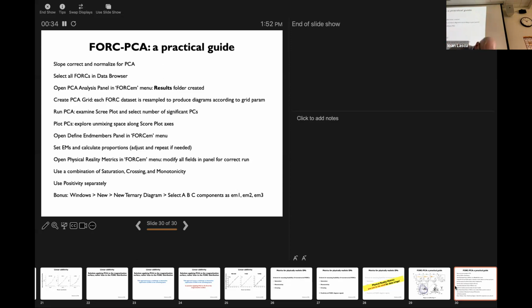Say that you can use an arbitrary color coding for the points representing the individual samples. My question is if you can, for instance, color code your sample according to the percentage of signal that is reproduced by your end member. So to see if there are samples where more of the signal is not represented by these end members.